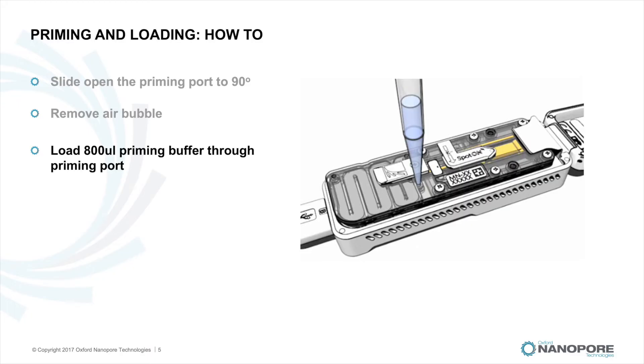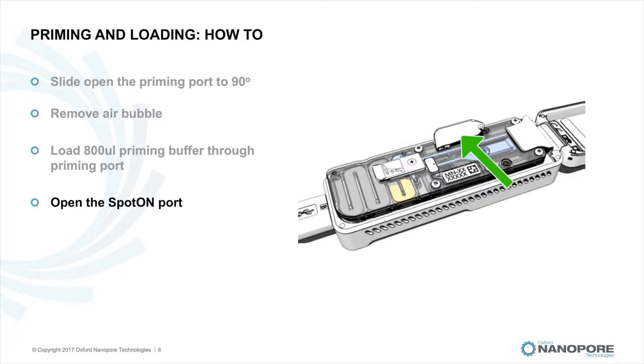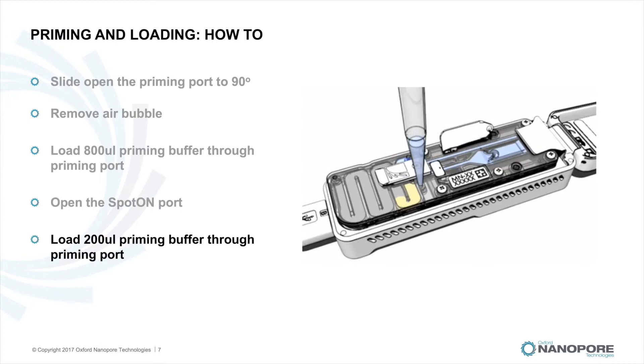In the meantime, ensure your sample or library is prepped and ready to load as stated in your protocol. Leaving the priming port open, gently lift the spot-on sample port cover to make the sample port accessible. Then load 200 microlitres of the priming mix into the flow cell via the priming port — not the spot-on sample port — avoiding the introduction of air bubbles.